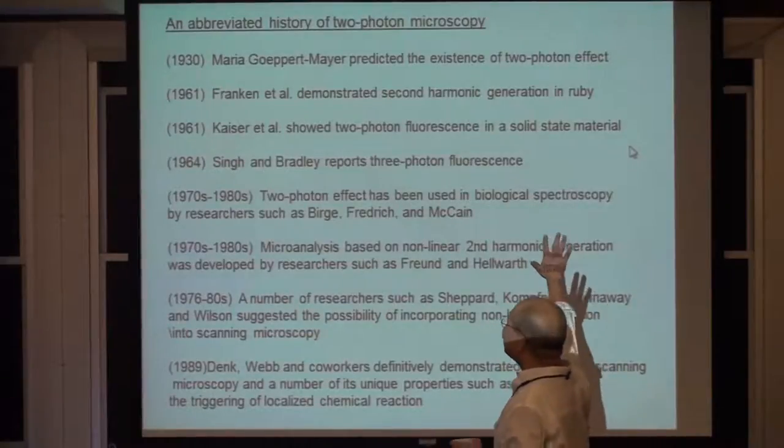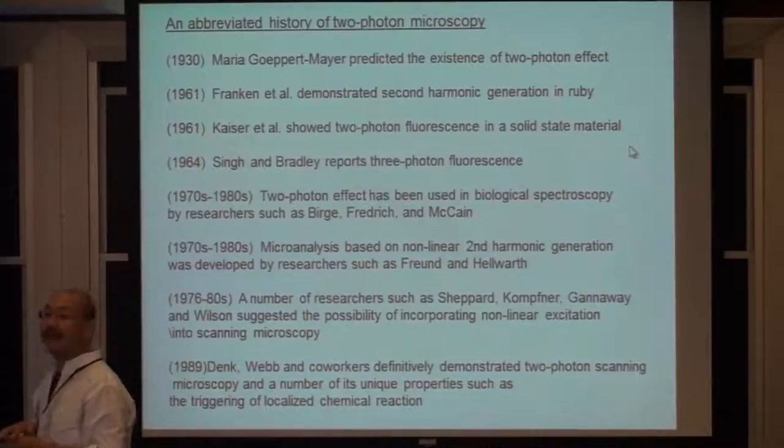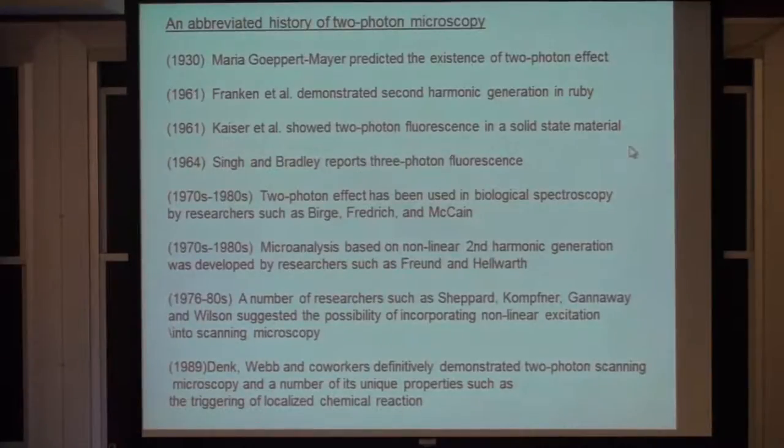But around the 1960s, a number of experiments showed that two photon excitation or related processes are possible and demonstrated them experimentally. But no one really used the process for very much until about 1978.